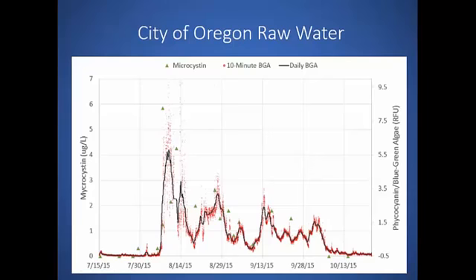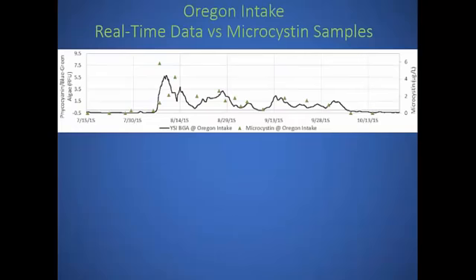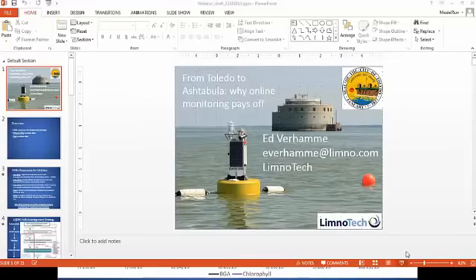And so, again, the sonde is just a tool. There are other parameters the sonde is measuring. Brenda mentioned those as well. I want to make sure I had enough time for Paul to describe the system. So I talked about some of the parameters, and then I'm going to turn it over to Paul to talk about the system as fast as I can. Thanks, Paul.